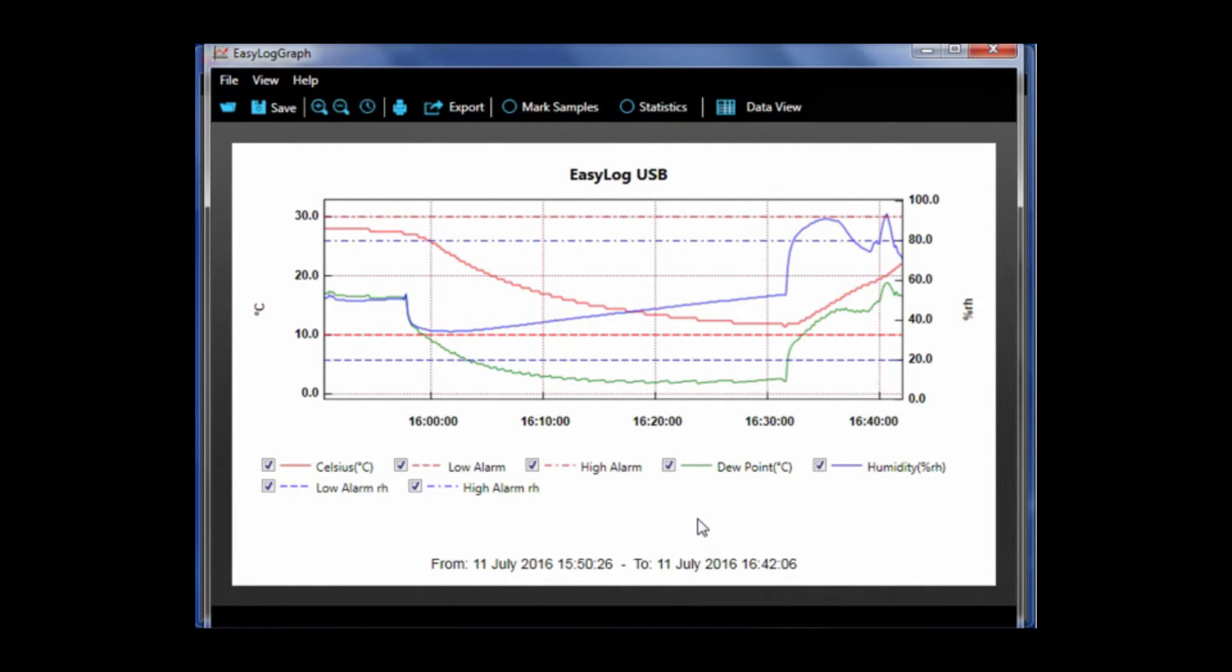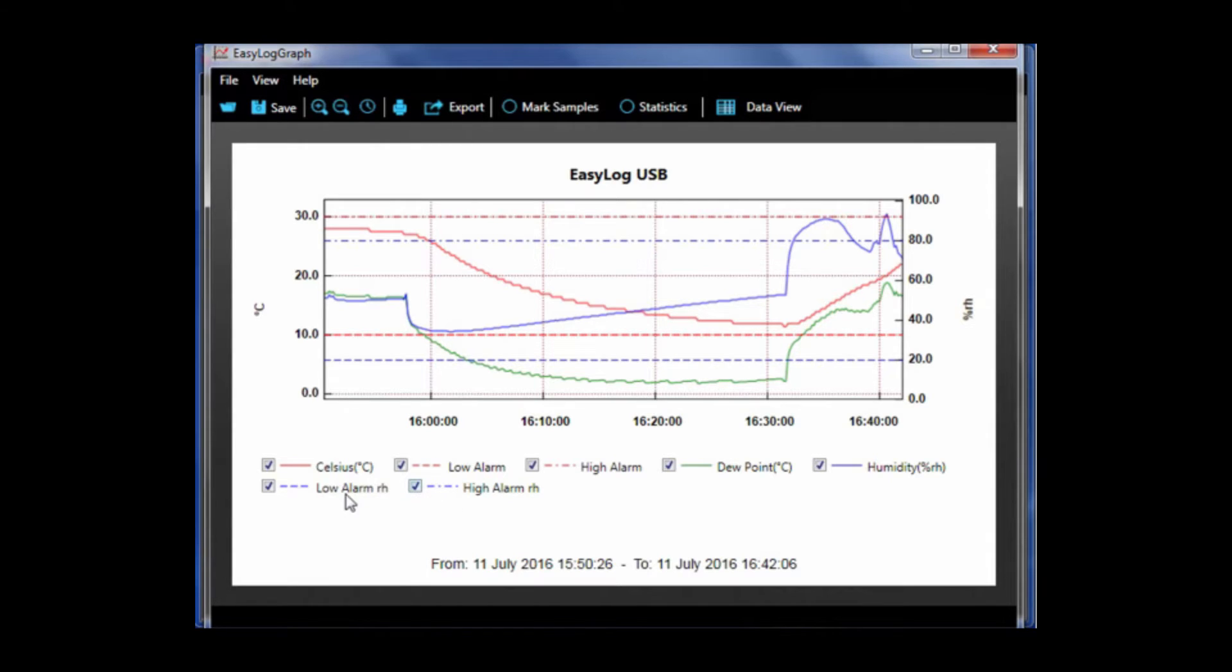Here is our graph. As you can see there are multiple traces: temperature, humidity, dew point, and any associated alarms. Again I'm using an EL USB 2 LCD, but if you are using a different logger you may see different traces.